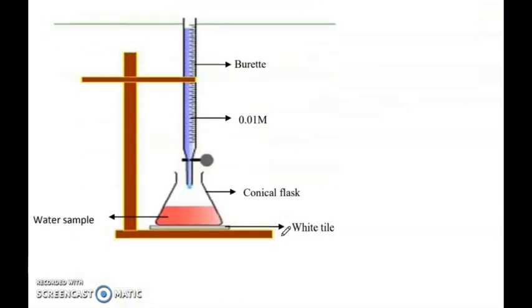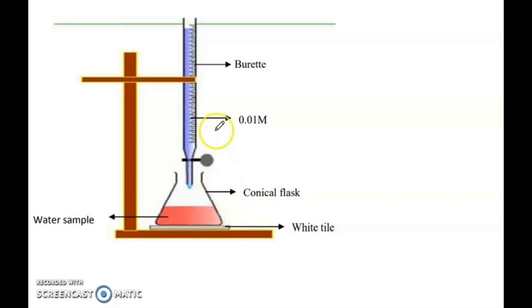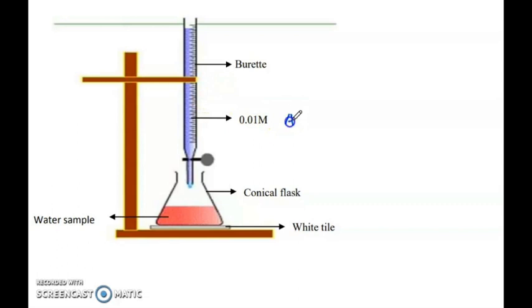For the practical setup: this is your burette and this is the wooden burette stand. In the conical flask, we have taken the water sample — 25 ml water sample is taken here. This is our 0.01 molar silver nitrate AgNO₃ taken in the burette. The burette is filled with the silver nitrate solution.